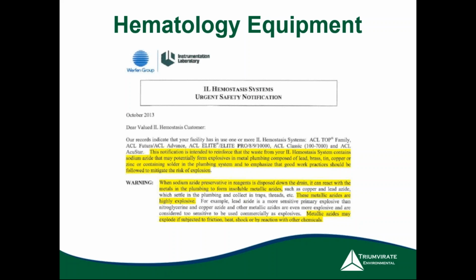A couple of our clients actually received this notification, and we went in and performed an assessment to see if and where the hazards were present, and it's around a lot more than people think, because of that drain disposal. It's so common for this hematology equipment.